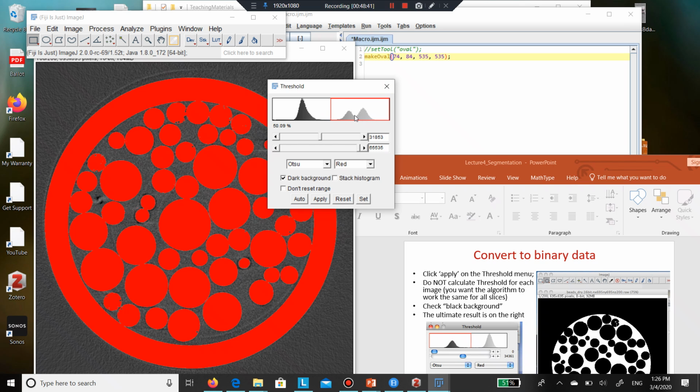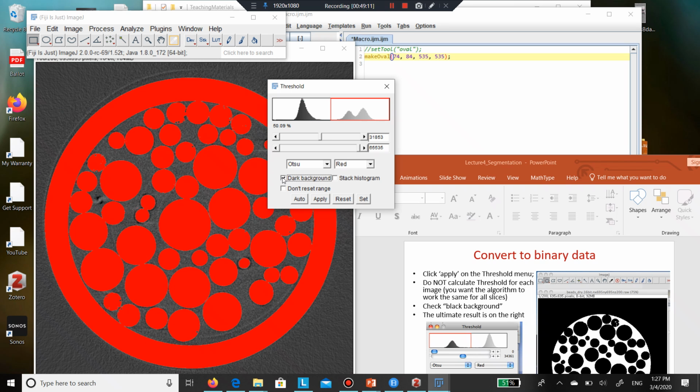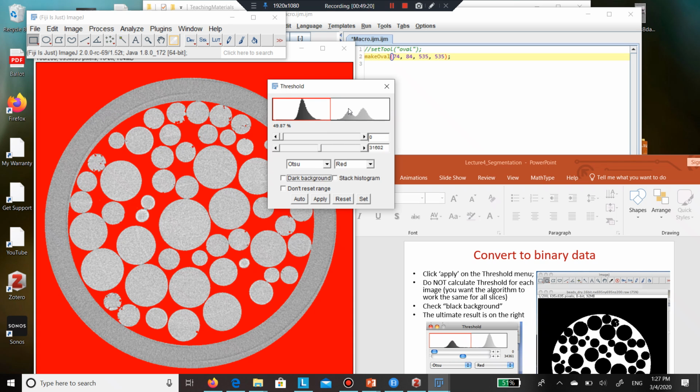It depends. Here it shows those values that are not so dark to be red, and it shows you here what it's choosing. It's a choice. What's on your computer? What's the default? Now, why did it flip this? It's a dark background, maybe. There we go. See? You flip that choice. See how it flips? So you can play with that.